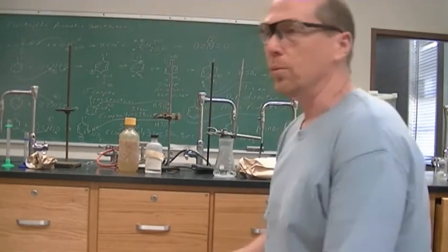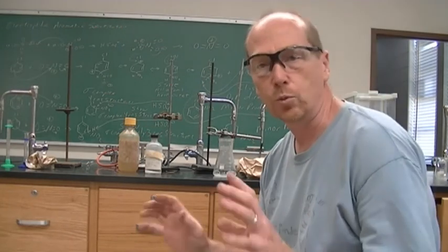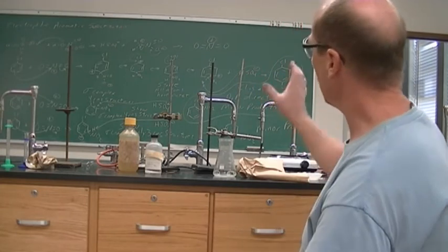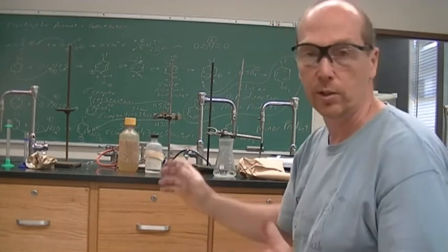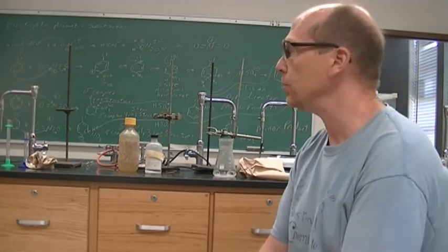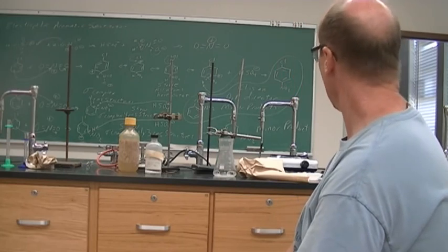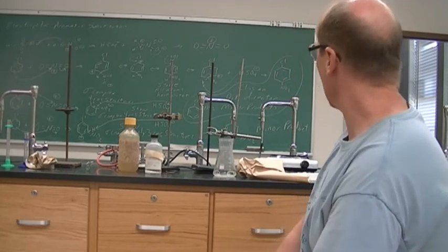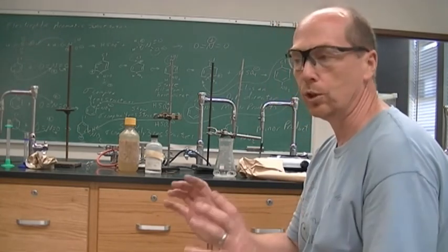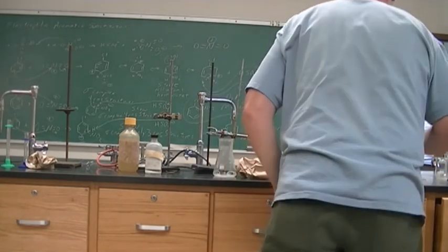All right, I don't think we're going to do the melting point. The melting points of the three products are all very different. Since we're getting the three products, we are just going to get a yield. Since the molar mass of all the products are the same, the yield is going to be of the three things. And if we had our IR going, or GC going, or another way, we could see the different percentages of each one of those that we have. But right now we're just going to do a percent yield by getting the mass of our product.